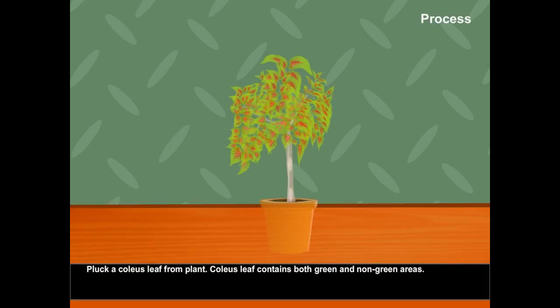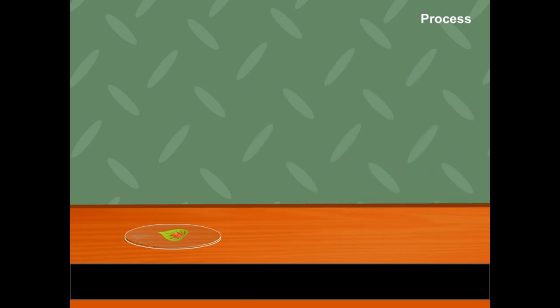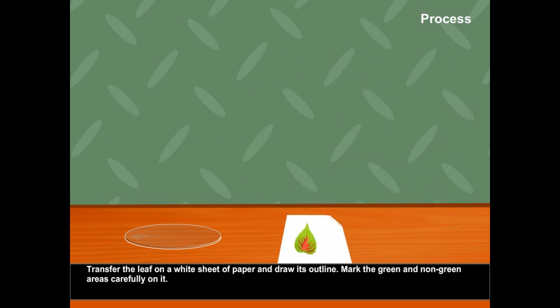Process: Pluck a coleus leaf from plant. Coleus leaf contains both green and non-green areas. Transfer the leaf on a white sheet of paper and draw its outline. Mark the green and non-green areas carefully on it.